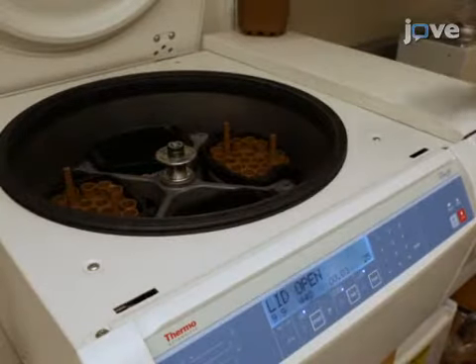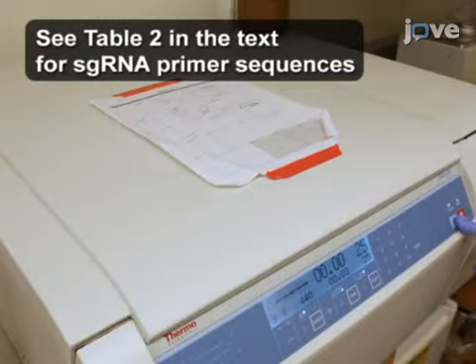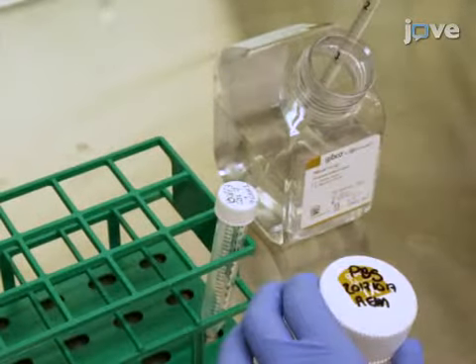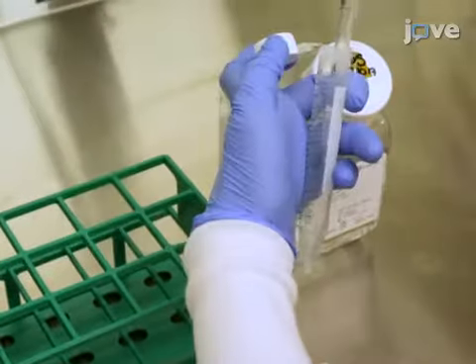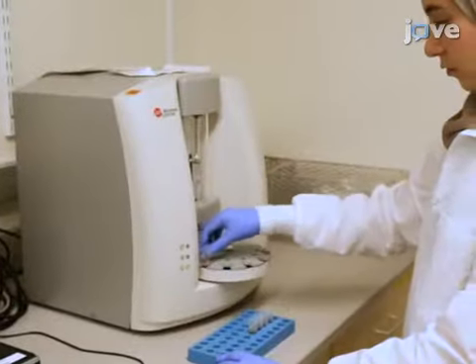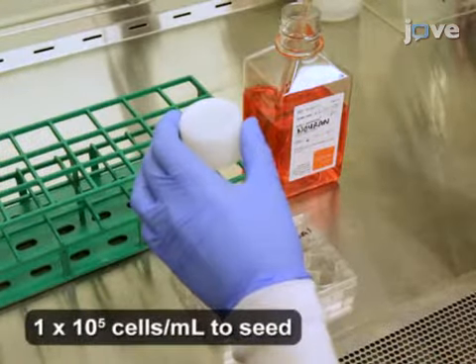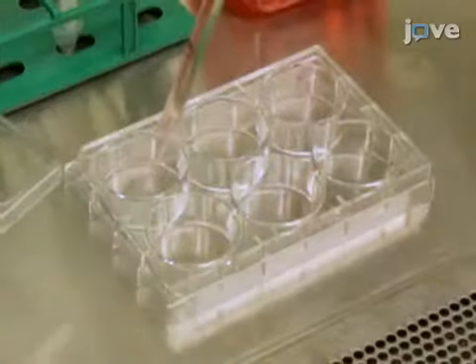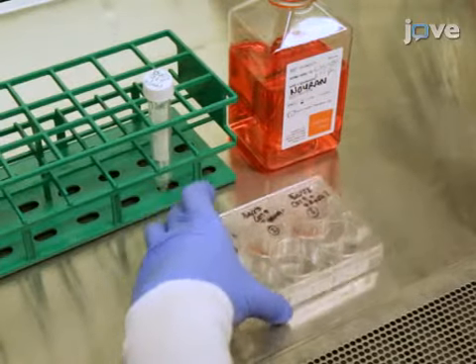Spin the exponentially growing BaF3 cells expressing ectopic Cas9 and the single-guide RNA of interest. Aspirate the supernatant and wash the cells with 5 milliliters of phosphate buffered saline. Spin the cells down and wash with phosphate buffered saline 3 times. Then count the number of cells using a cell viability analyzer. After this, seed cells in triplicates in 2 milliliters of fresh media without interleukin-3 in 6-well culture plates. Start monitoring and counting the cells every 2 days for 8 days.